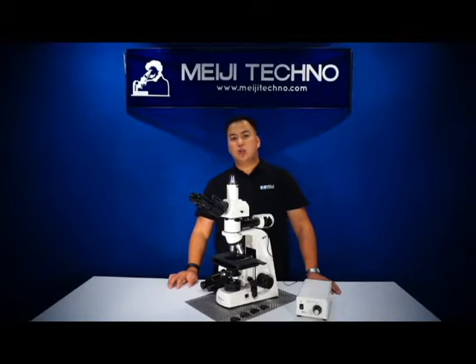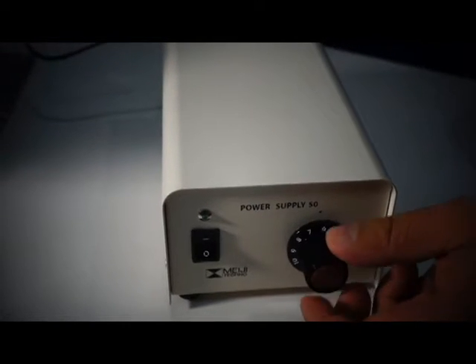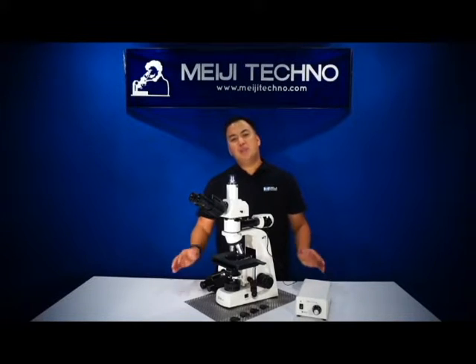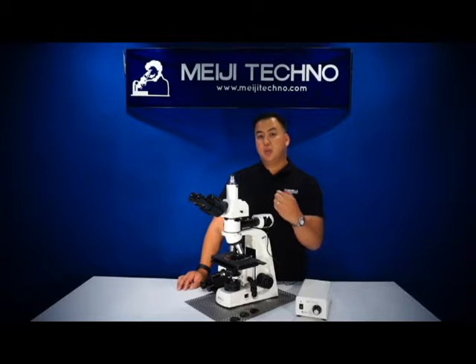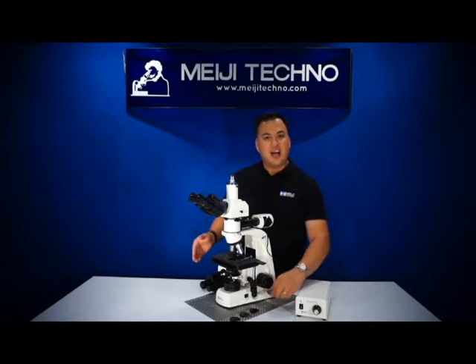For transmitted illumination, it comes with a 6-volt 30-watt illumination. It's capable of doing brightfield and simple polarization techniques. The MT-8000 comes with four standard filters: blue, green, neutral density, and a polarizing filter in a metal mount that fits perfectly onto the slot.